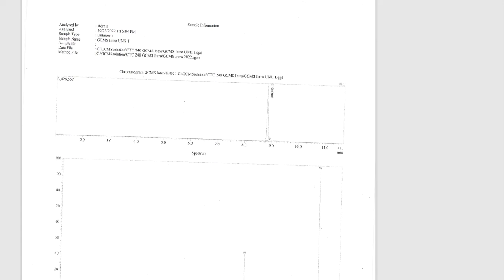Okay, so now you know a little bit more about the basics of running a sample, getting it onto an MS instrument, and connecting real life to what is often shown in a textbook. So this is what your reports are going to look like. I want to take a minute or two and talk about the actual report and where to find this information, so that it will help you out when you get ready for this.